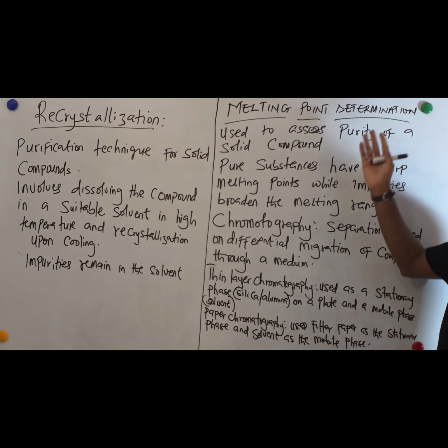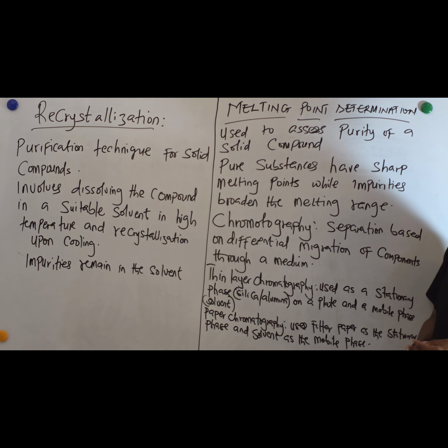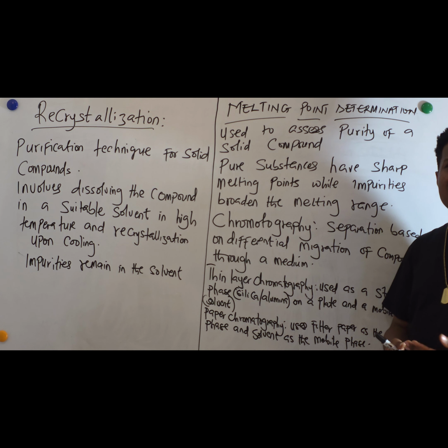One I'll talk about is melting point determination. How can we determine the melting point of a substance? This melting point determination is used to assess the purity of organic compounds, of solid compounds.